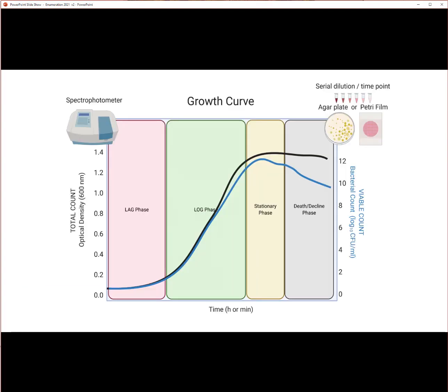Right, let's look at the spectrophotometer, or the growth curve. Growth curve can be measured in two different ways. You either look indirectly at the optical density, where you just look at the cloudiness over time, which can be measured by a spectrophotometer, or you take a sample at different time points, dilute it out, and then measure the CFU per ml with diluting plates, what I just explained before. Both of them can give you similar results for growth curve analysis.